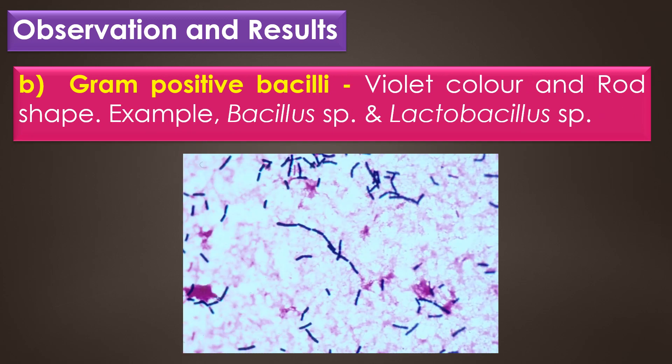Gram positive bacilli appear in violet color and rod shape. Examples for gram positive bacilli are Bacillus species, Lactobacillus species, Clostridium species, and Corynebacterium species. This image shows the gram positive bacilli.